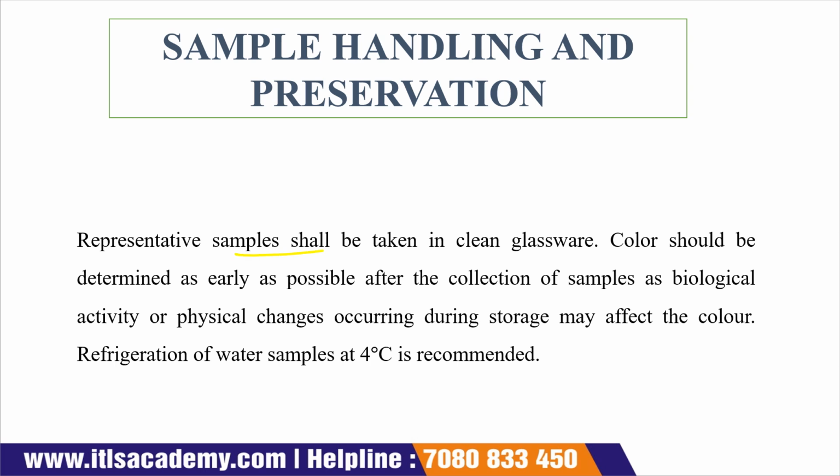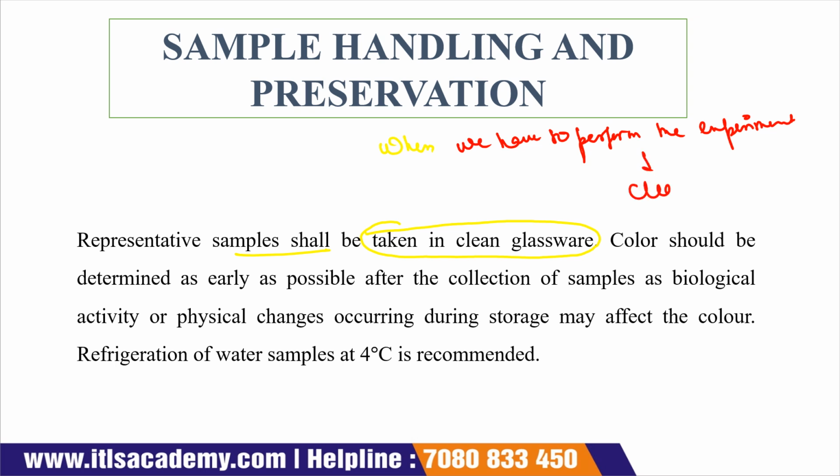A representative sample shall be taken in clean glassware. We all know that when we have to perform our experiment, in that case, we have to take clean glassware.